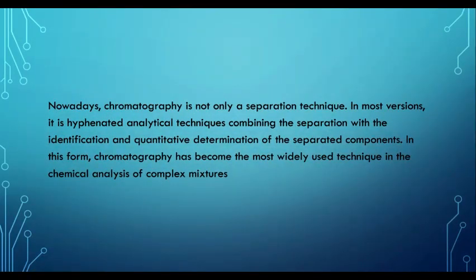Chromatography is widely used in the chemical analysis of complex mixtures. Chromatography is not only a separation technique; in most versions, it is a hyphenated analytical technique combining the separation with the identification and quantitative determination of the separated compounds.